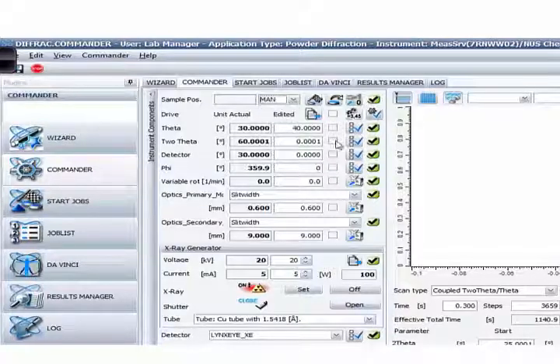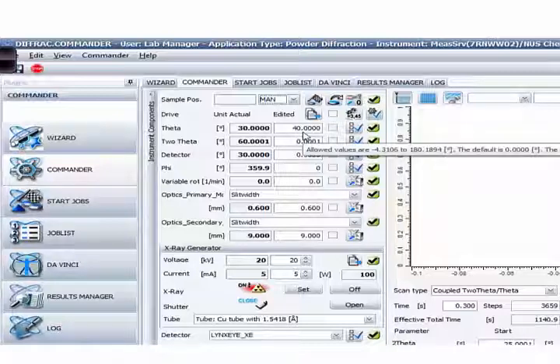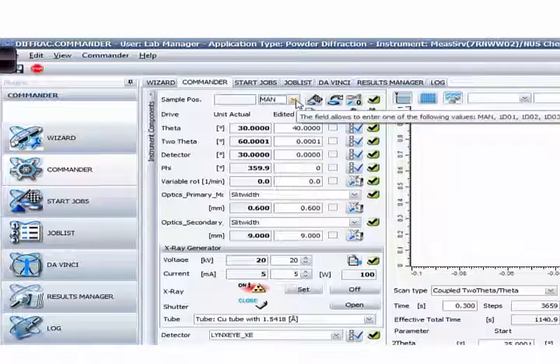If you really need to do it manually, you can — put in your sample, go through the same process, load manually, and then you can check different angles for theta and the detector when you want. However, I do not encourage using the manual mode; everything manual goes to maintenance.